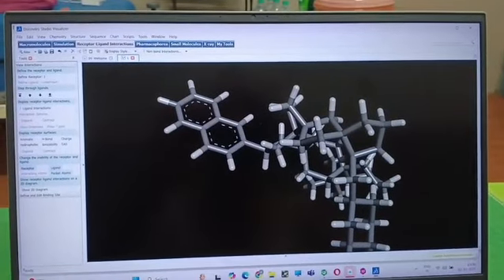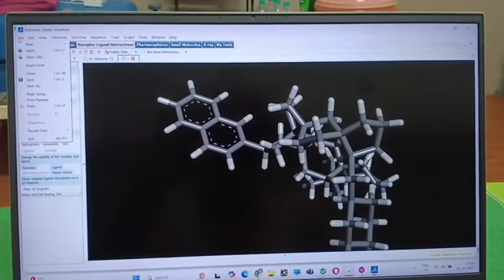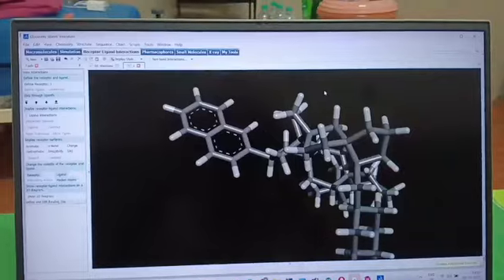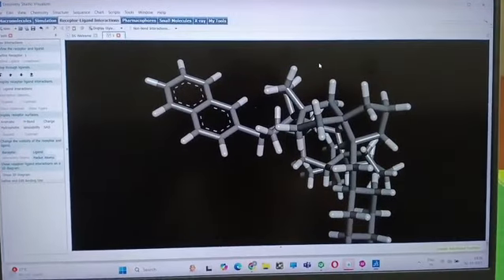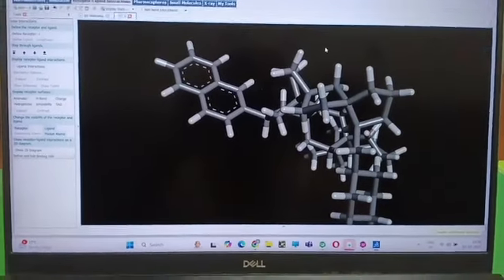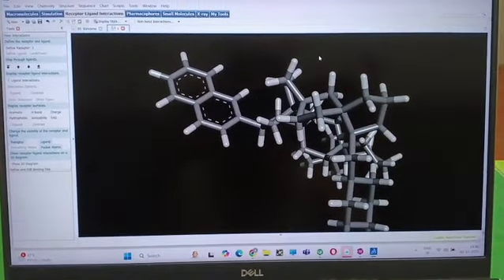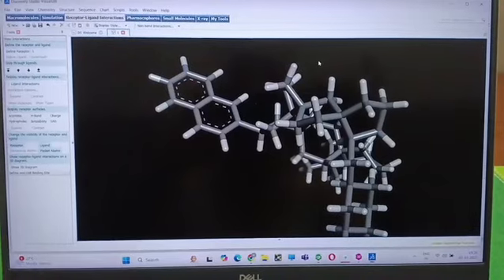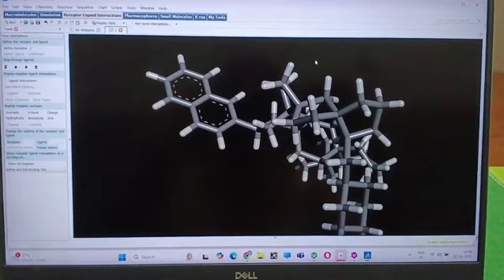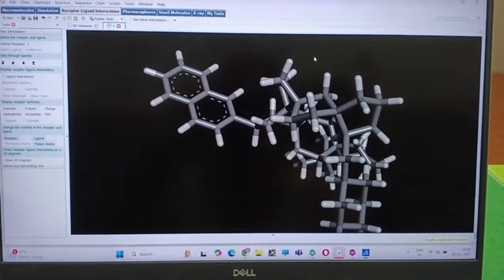That's how, if you want to save in this, it is possible to save as and so on, but you need a particular file like .pdb to visualize it in Discovery Studio Visualizer. How did we prepare it? First of all, we created a 2D file in Chem Draw 2D, and then we checked whether the structure is correct or not.